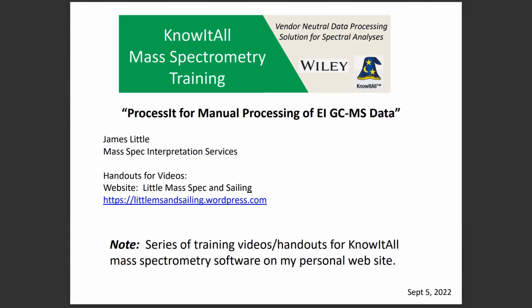So I hope you found it useful to know how to use Process-It for manual processing of EI GCMS data. Be sure to check out other videos from this series on my website that include other information on how to do library searches, structure searches, etc.